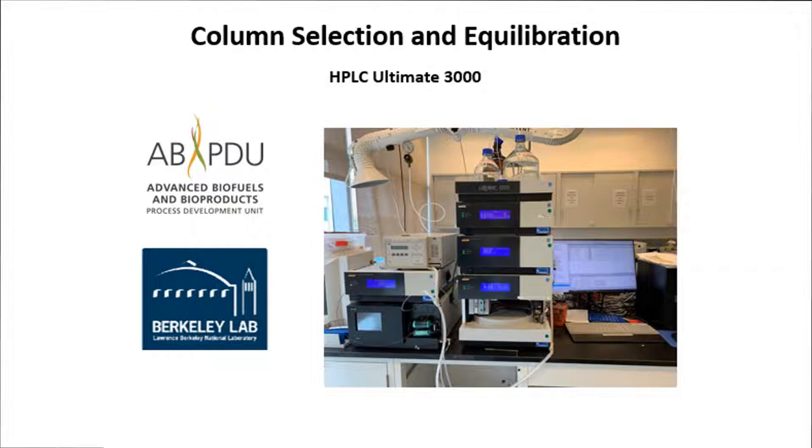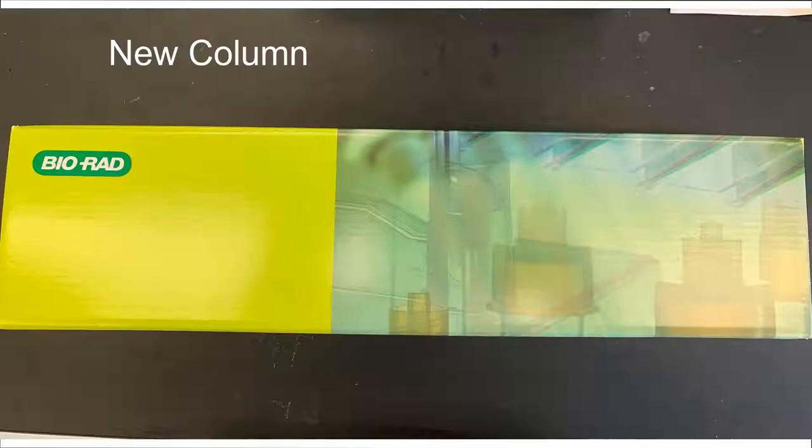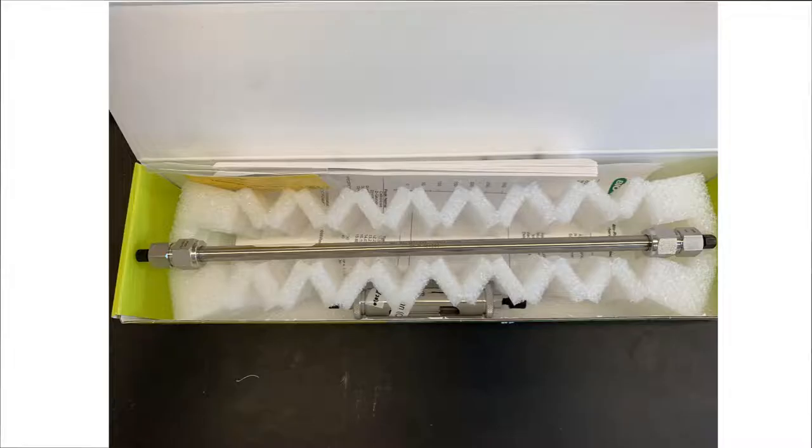Be sure you are using the correct analytical column for your application. Each column has different, unique operating parameters and applications. If the column to be used has not been running for a long time or is new, it should be equilibrated first, usually through an overnight equilibration.